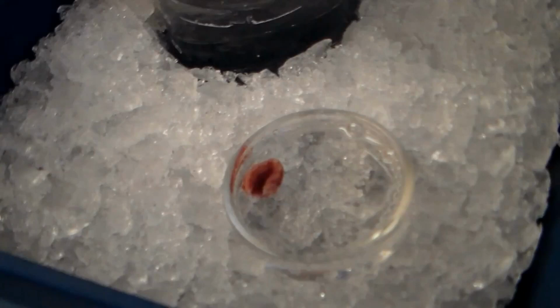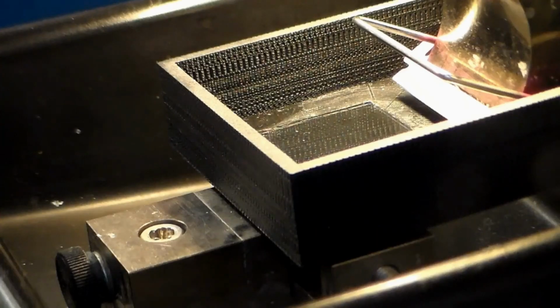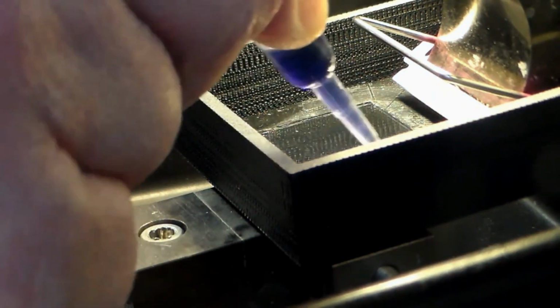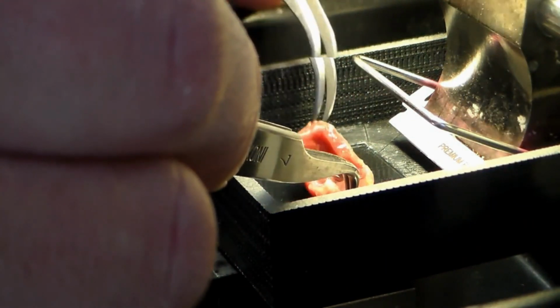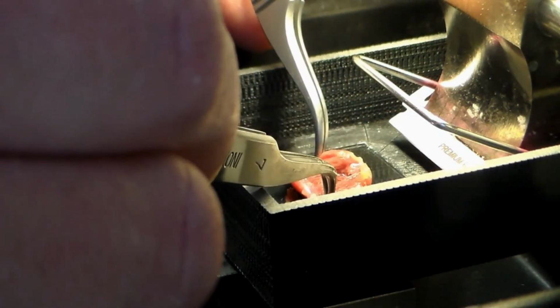I'm starting here showing you the ventricle as we had just previously prepared it on the previous video. We're going to put the heart onto this glass slide that's about 40 millimeters wide and about 25 millimeters deep. Here's a close-up, and what we're doing now is putting histoacryl adhesive onto that glass slide. And then we'll place the left ventricle onto the adhesive with the epicardium side down, and the endocardium is facing up.